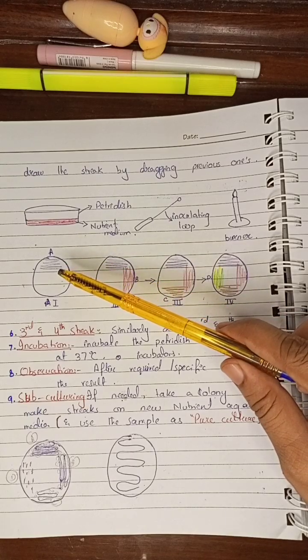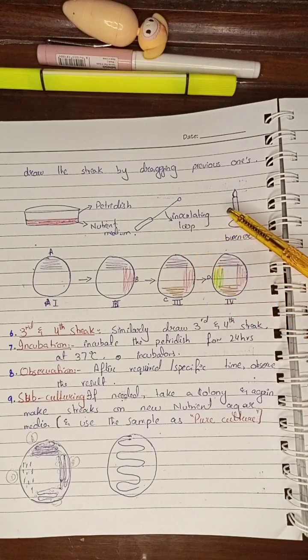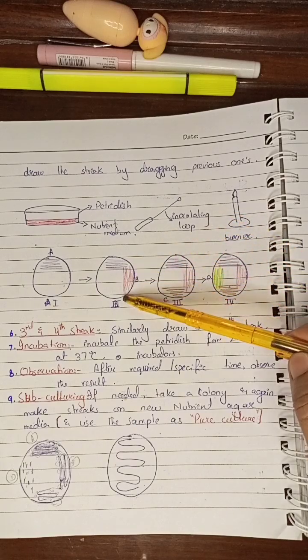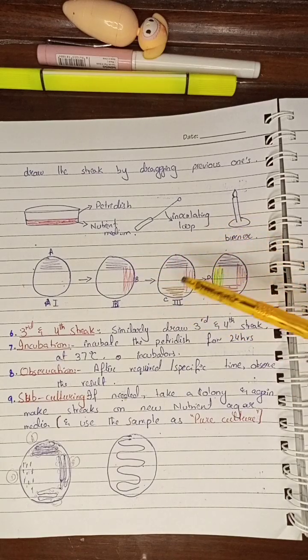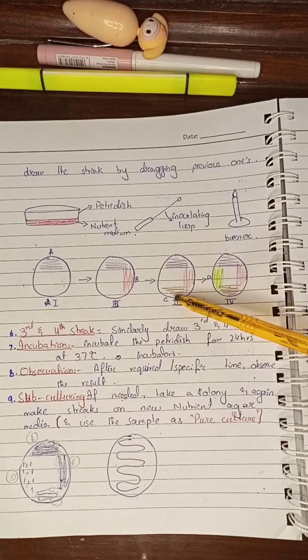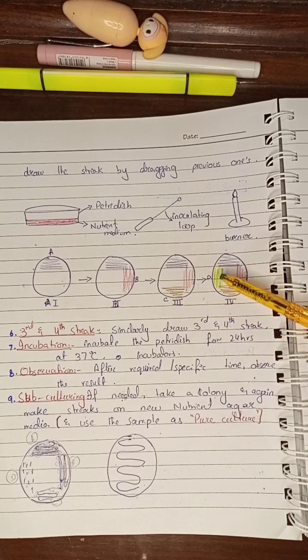First of all, make a streak in the first quarter, then sterilize the loop again and make a streak in the second quarter. Again sterilize it and make the streak in the third quarter, and finally in the fourth portion.